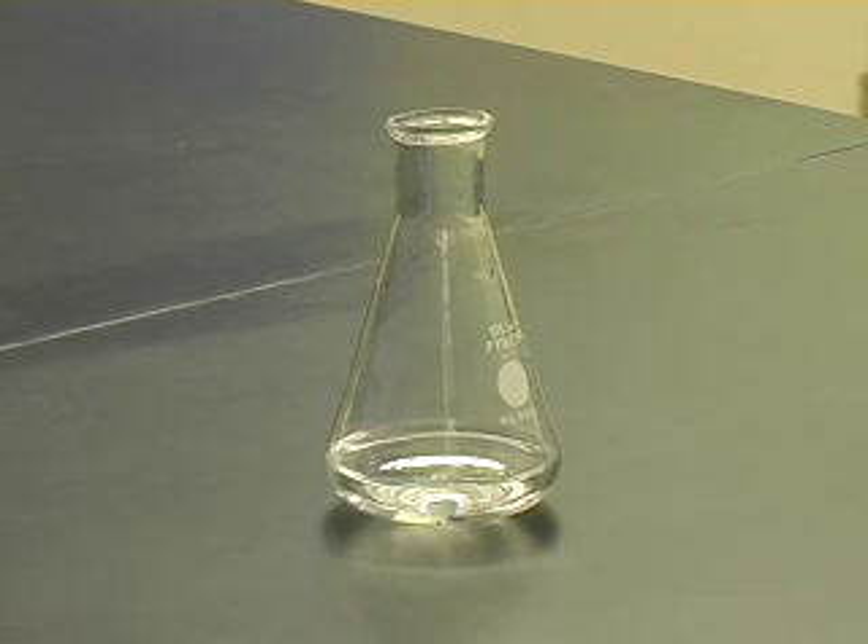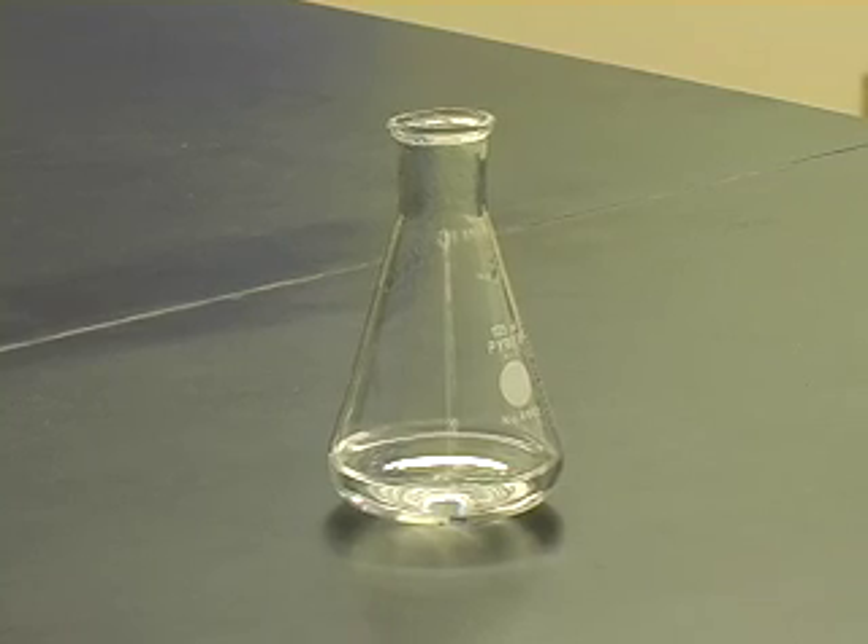After heating, all of the agarose should be dissolved in the buffer. The solution should be clear.